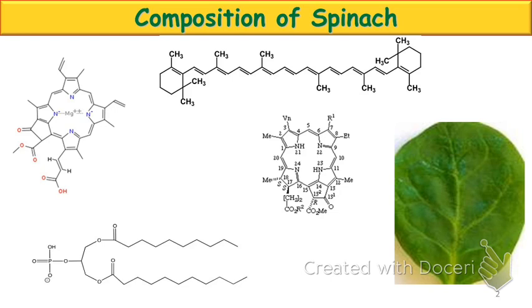So we can take a look at 4 representative compounds that could be potentially found in spinach. Okay? Could we go through and decide which of those might be the most polar? If I could, I mean, go ahead and do that. Which of those might be the most polar compound? Your eyes should probably drift lower and lower on the screen, okay? And not because you're falling asleep.